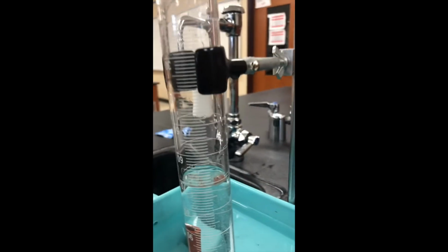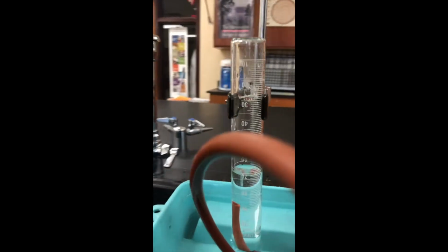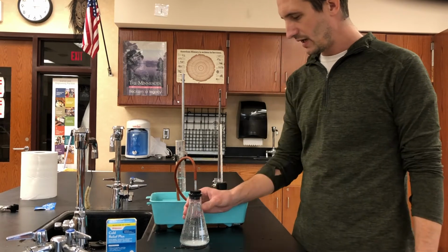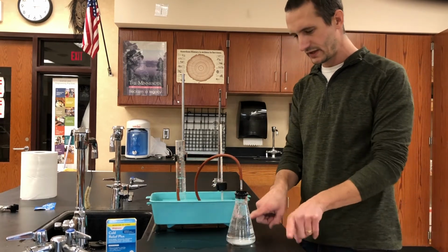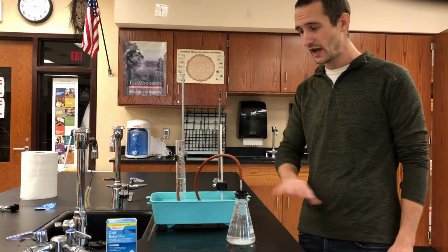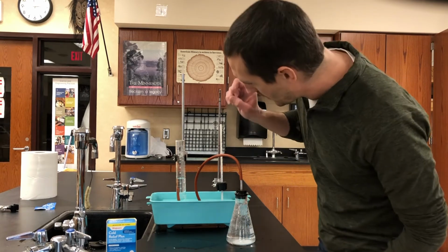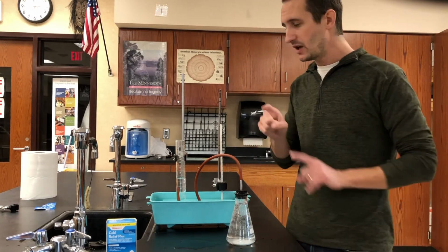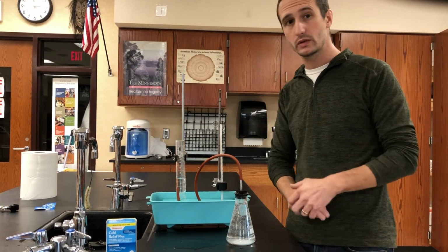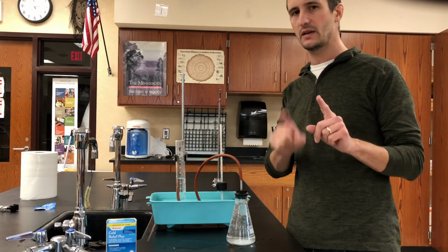It does appear that the reaction is just about finished. So looking at this, I have successfully collected the gas produced from the Alka-Seltzer tablet. The reaction is finished. Now, in order to calculate the number of moles of carbon dioxide gas produced, we need a few pieces of data.